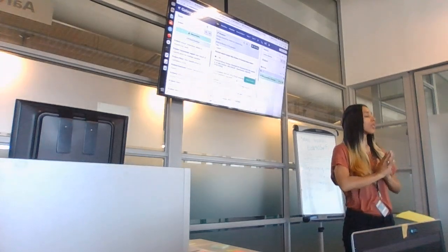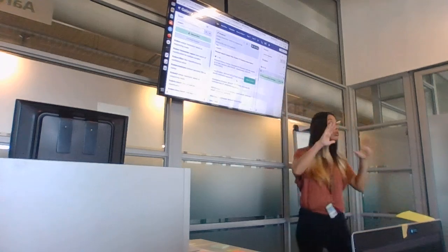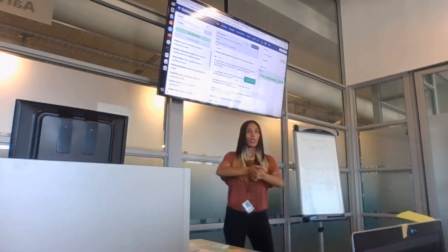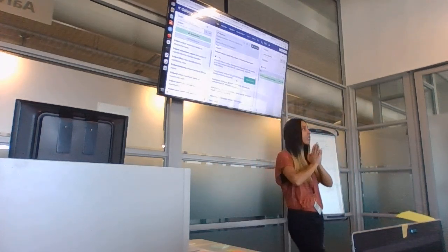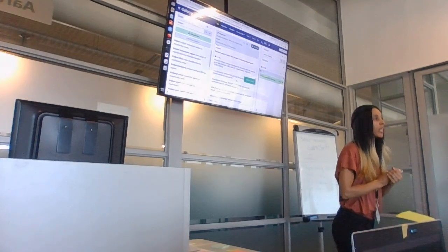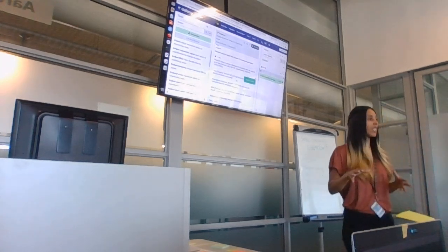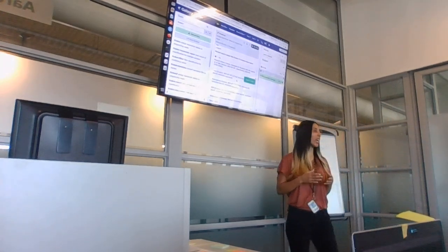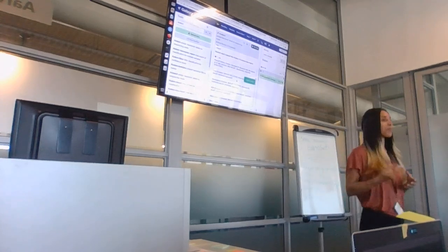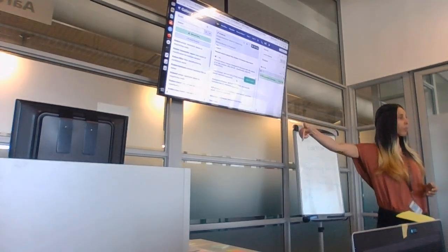So Kraken is like, with RefSeq they've got even more. If you have an idea what you think your contamination is, like you know your body went to the toilet, didn't wash his hands, and you had an E. coli bug or something, you may choose only to run it against a bacterial database.